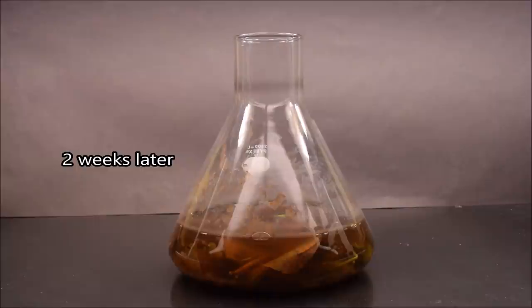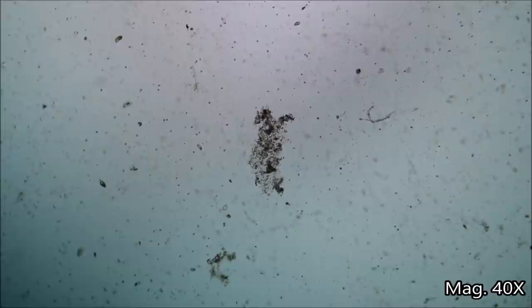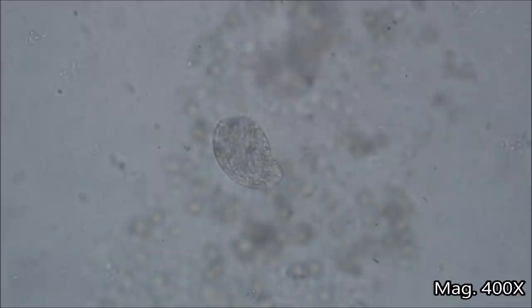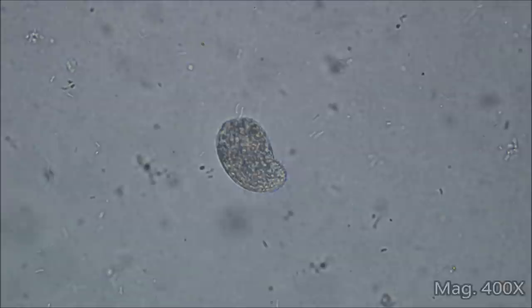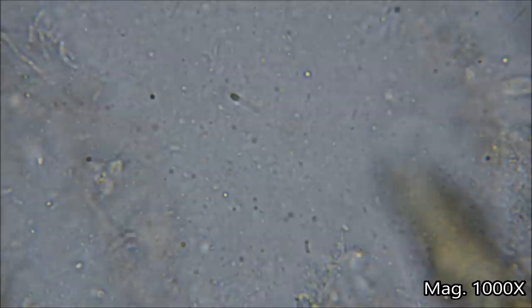After about two weeks, the plant material rots and the water looks like this. Now let's see what grew inside. As soon as I looked at a sample under the microscope, I saw a ton of microbes moving around. We can see microbes of different shapes and sizes. The bigger ones are called protozoa, which is a general term for large, animal-like, single-celled organisms. The tiny ones shaped like rods, spheres, or spirals are mostly bacteria.